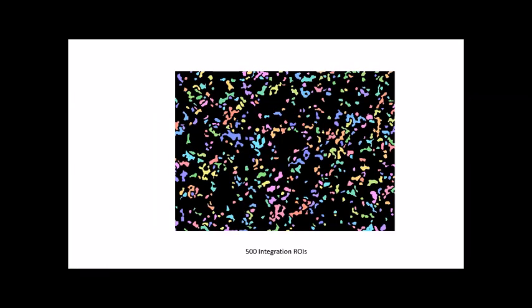Okay, and that gives us a lot of flexibility and some increased speed relative to other microscope types. Note that we don't have to jump between one field of view and another. It's very, very different from using, say, scan mirrors in order to scan from one point to another. The real speed up of this approach comes from defining what we call integration regions of interest.